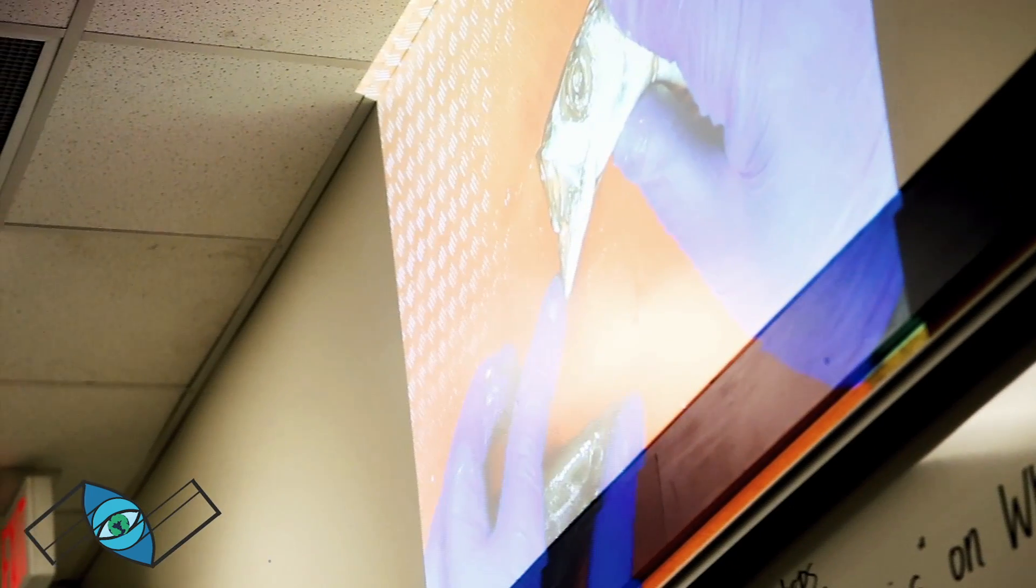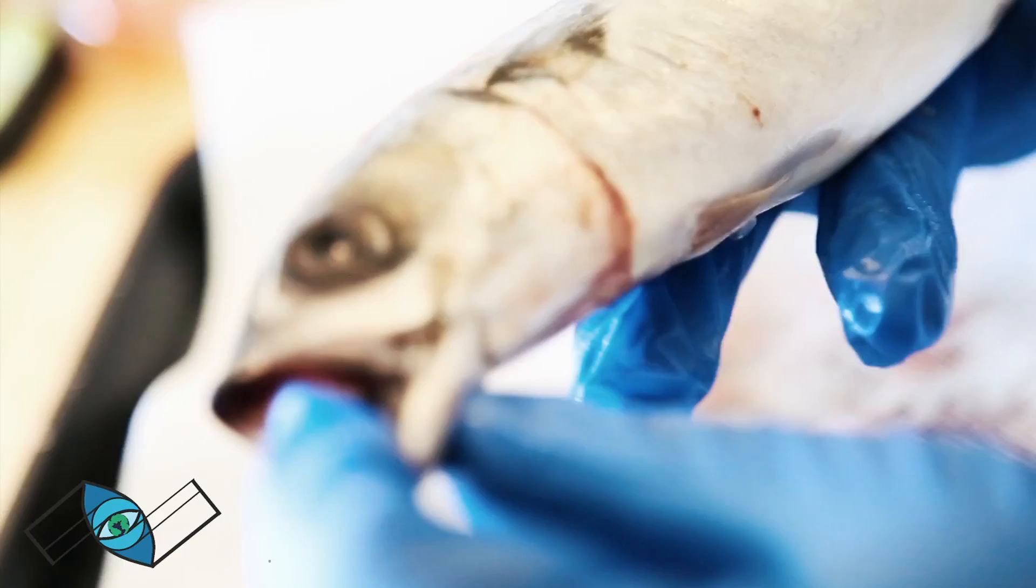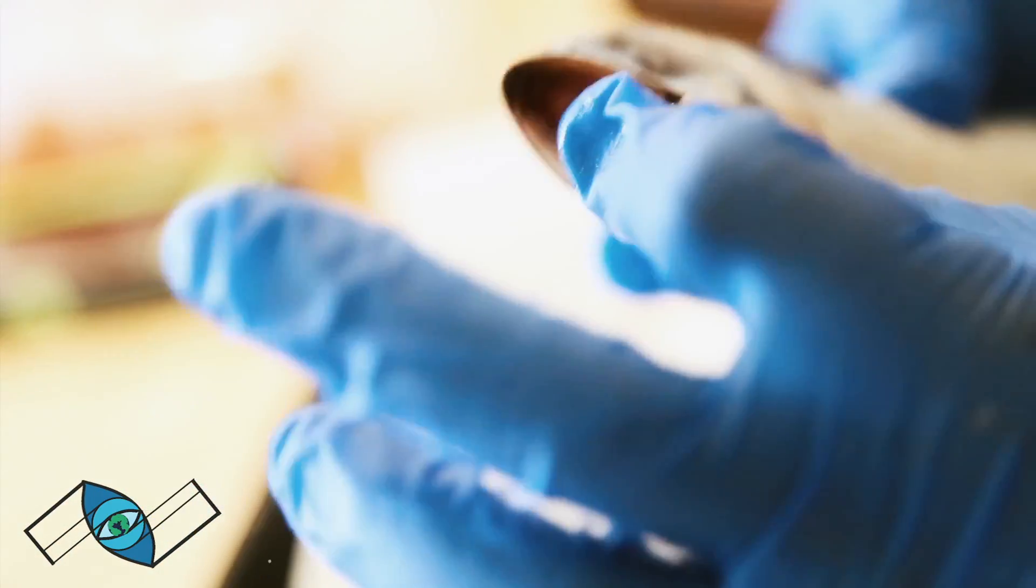We're interested in how fishes eat, so keep in mind that everything starts in the mouth. When the fish's mouth opens, you can see all that extension and expansion occur. This fish can actually eat other fishes and squid that are up to half, even three-quarters of its body size.